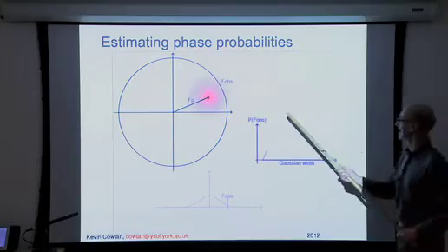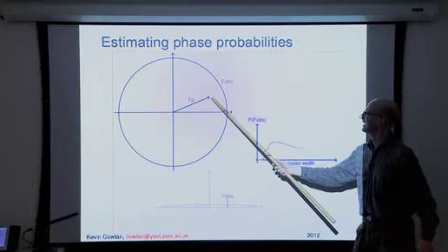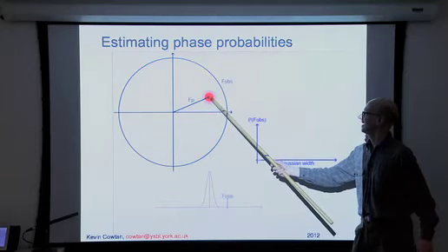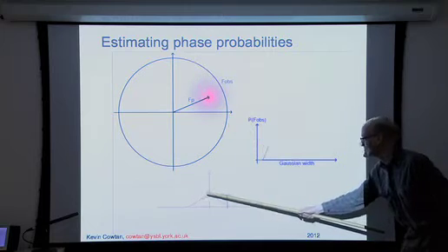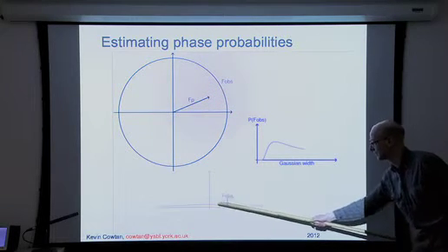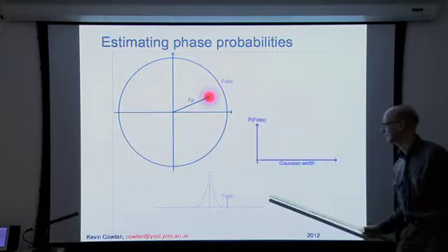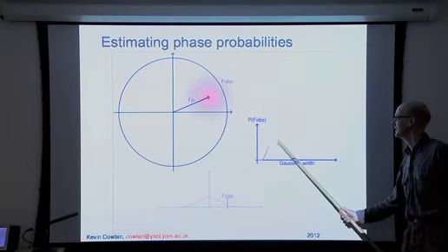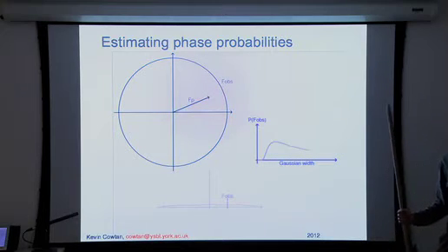So the area is constant. Good description of probabilities. So as we spread out this Gaussian, its overlap with the observations increases. Here we are. You can see it spreading here, and it goes up, and then it goes down again because the center's going down. So it goes up as it gets wider, then goes down again. And that means we can get our maximum likelihood estimate of the uncertainties.